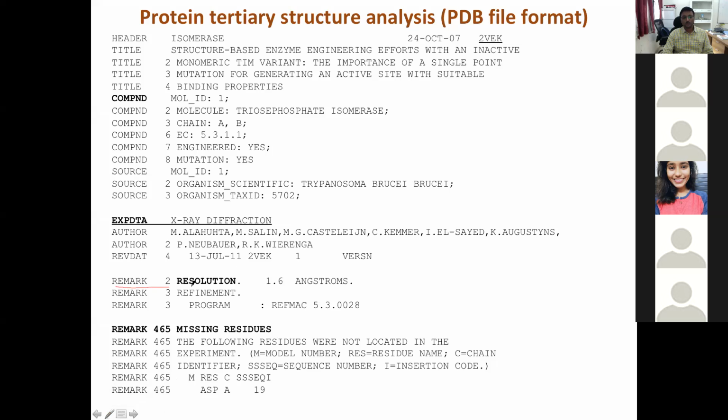So, this is something very, very important. This is one parameter that you look into in order to understand how good the structure is. As I said, the lower the resolution is, the better resolved the structure. Numerically lower the resolution is, better resolved the structure. So, this is 1.6 angstrom, and this is a really high resolved structure.